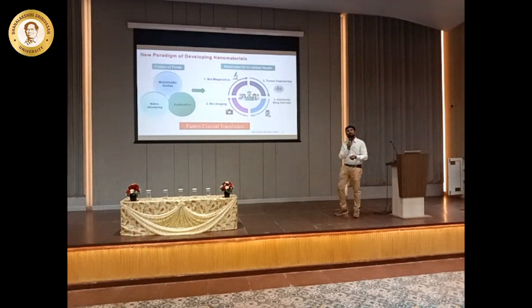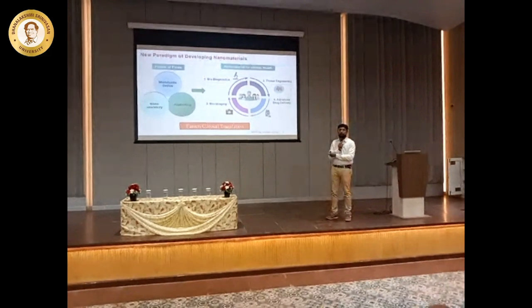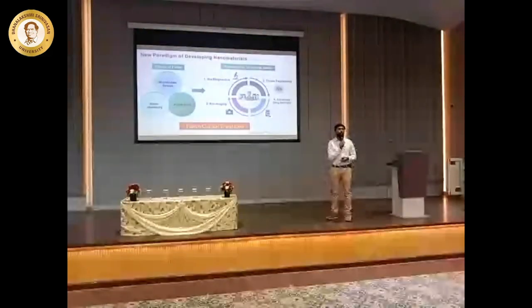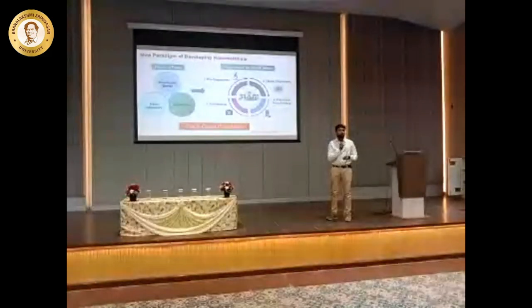The problem is the batch, well, I'll tell you what the problems of the batch reactors are. There are so many problems. We talk about different properties there: the size, the structures, the composition. It's all going to play a major role. If you want to control all these things, that is not possible in a beaker. So I want to bring it into smaller microreactors, where I can make the beautiful nanostructures that I wanted to create, which will explicitly work on certain diagnosis or certain sensing.